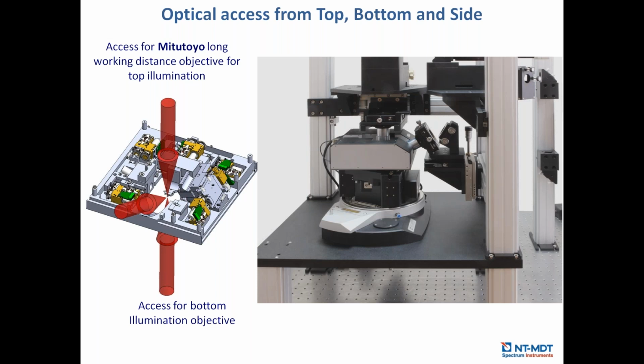with no damage to the sample and no damage to the tip, because it eliminates all the lateral forces acting on both sample and tip, and it decreases the TERS signal only 2 times, or even less, because at small distance from the surface you can still have an enhancement.